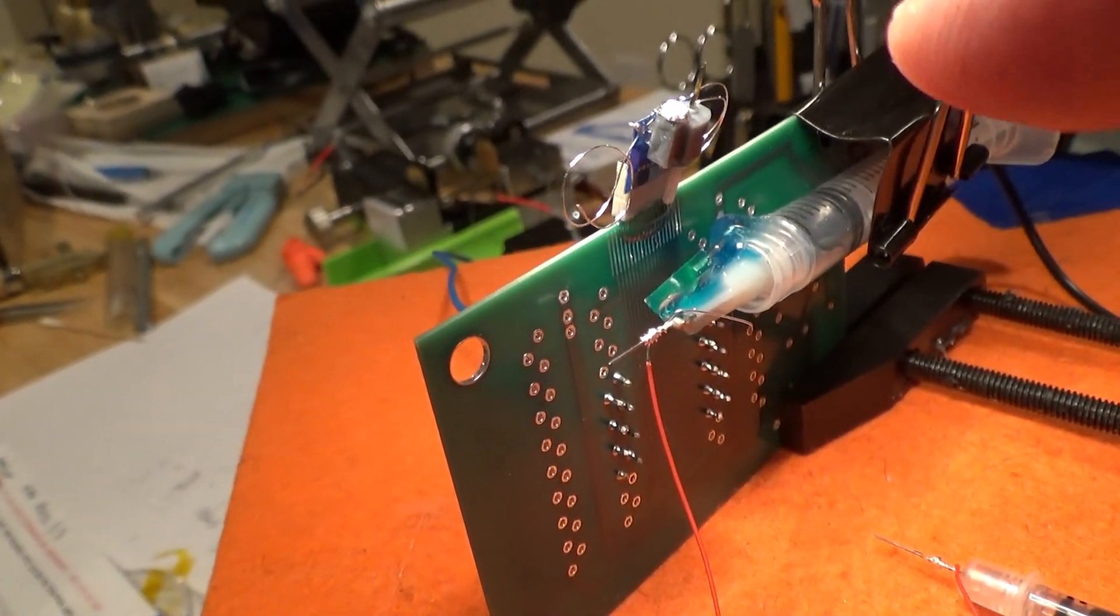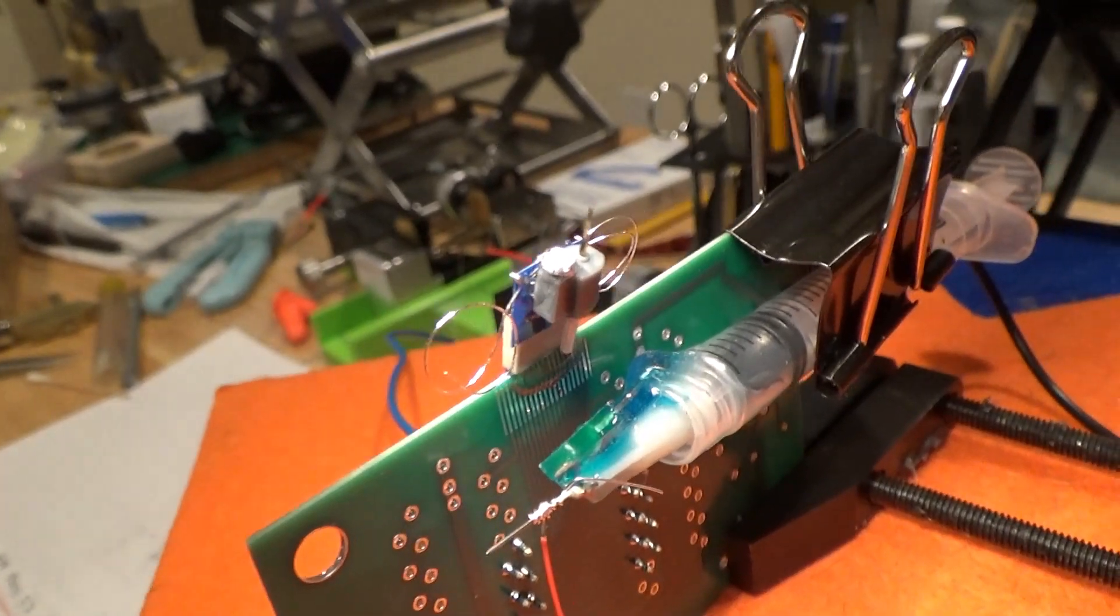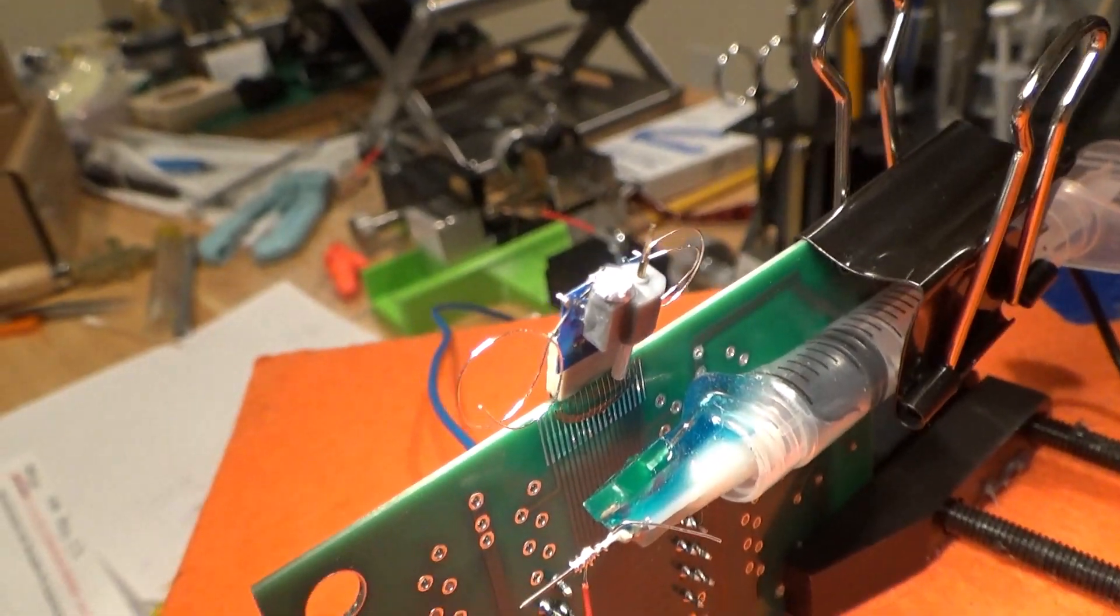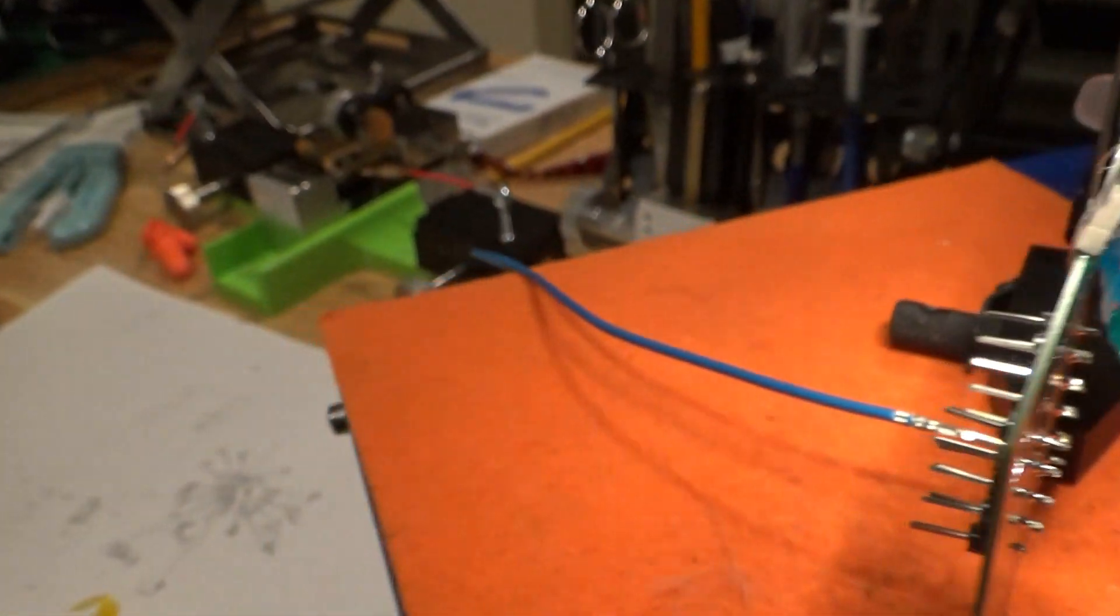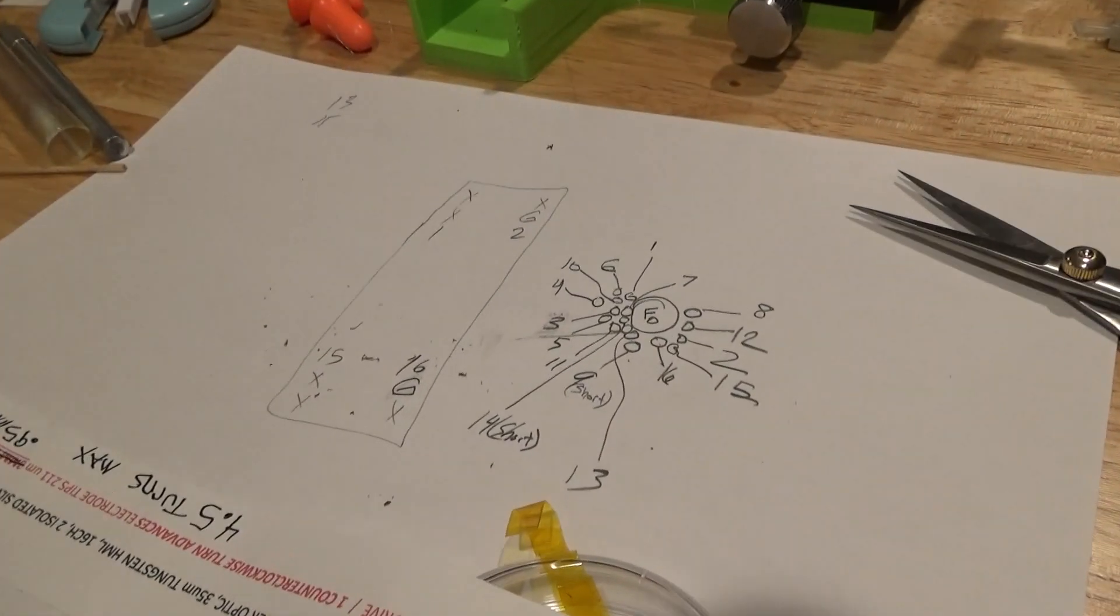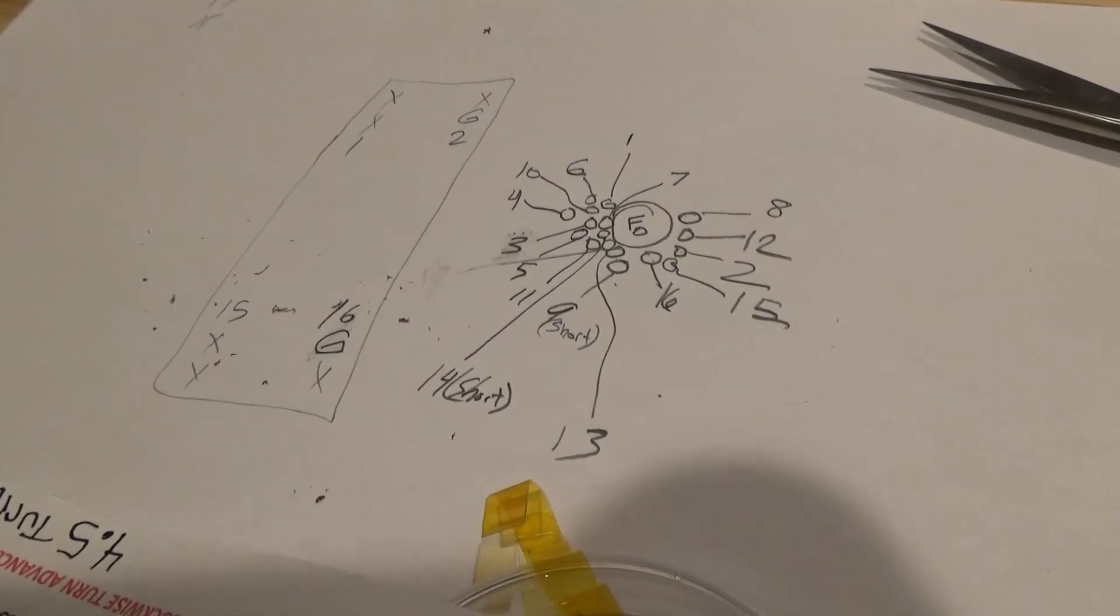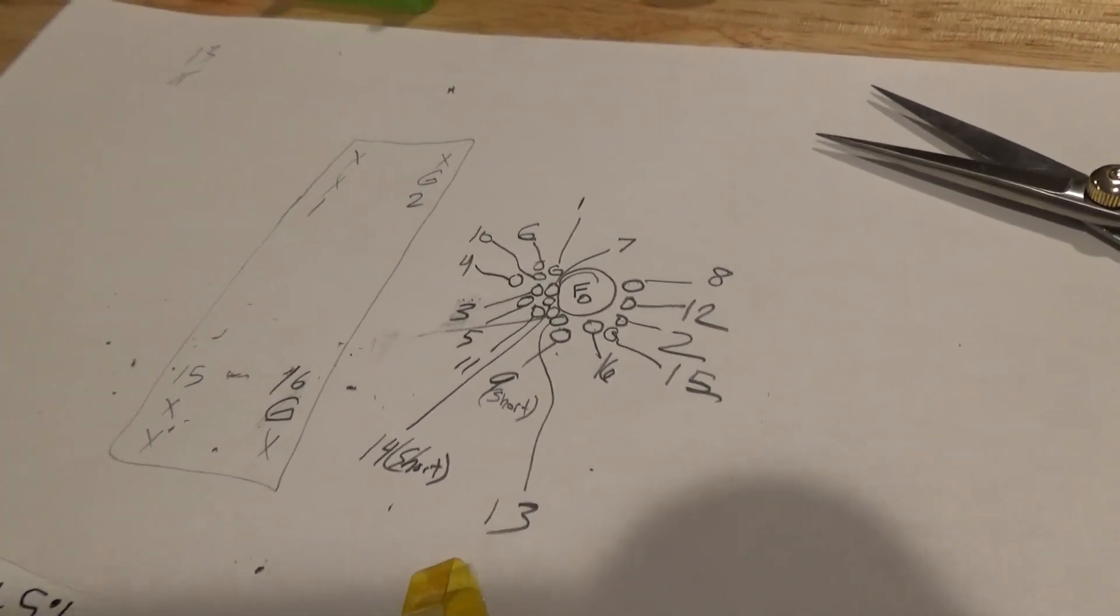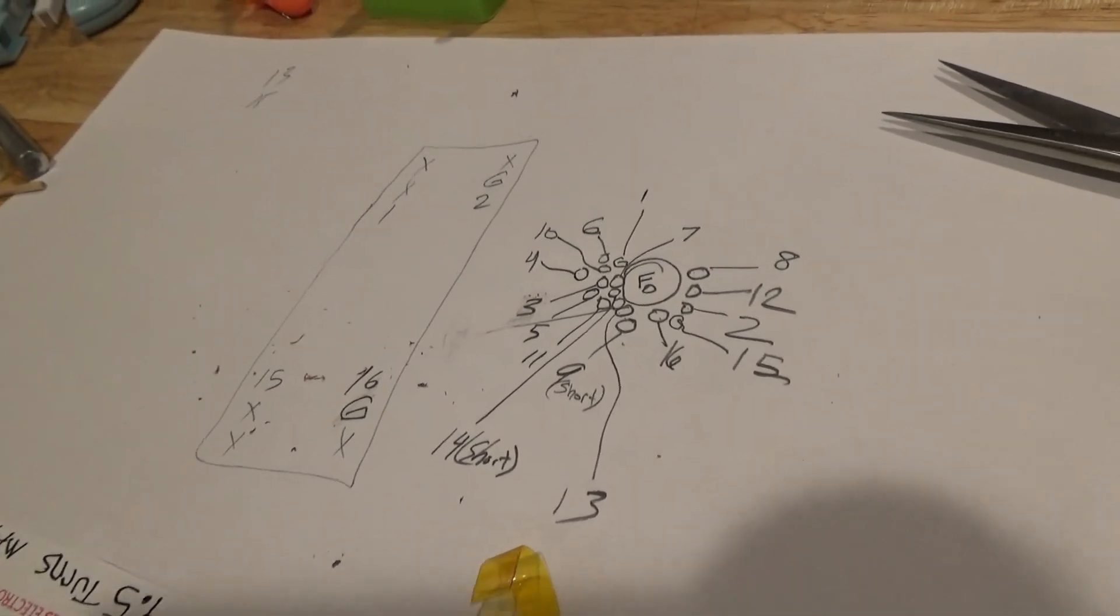This is what I do with the very tips of the micro wires. When I find them, I sketch out on paper the approximate location in relationship to the connector and the fiber core.